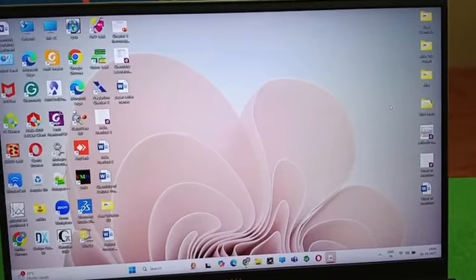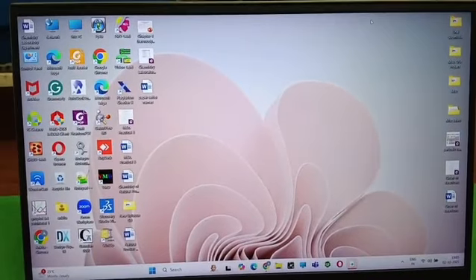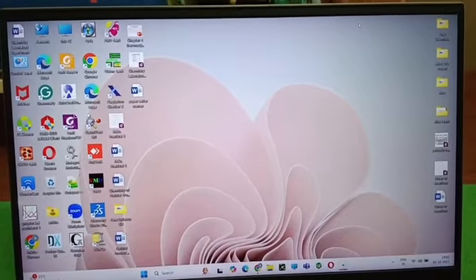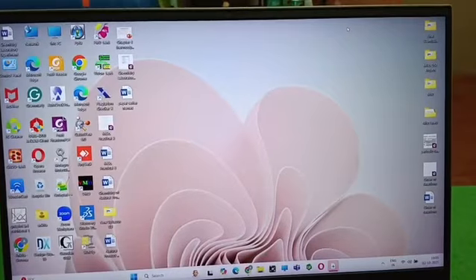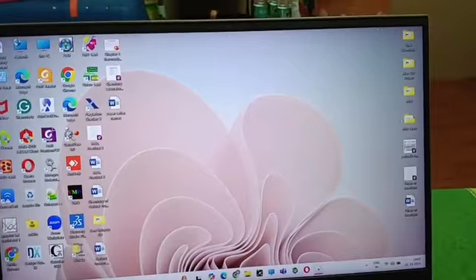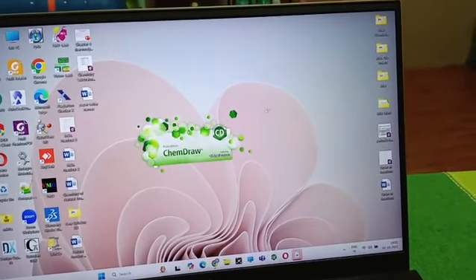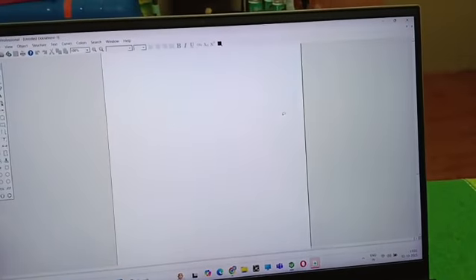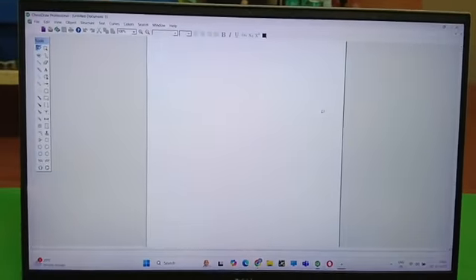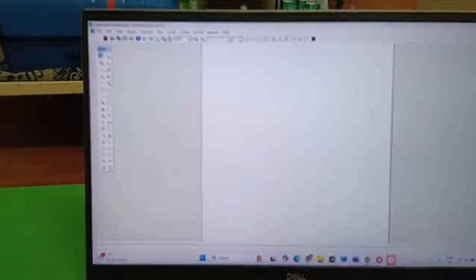Students, today we are going to see how to draw structures in ChemDraw, how to do all these things. So I am showing you my screen by opening ChemDraw, and you may understand how to do all these things. So you see, first of all I am opening ChemDraw. Here it is ChemOffice. So 2D structure first we are looking for how to draw it, and then after we will move towards 3D and other branches of it.